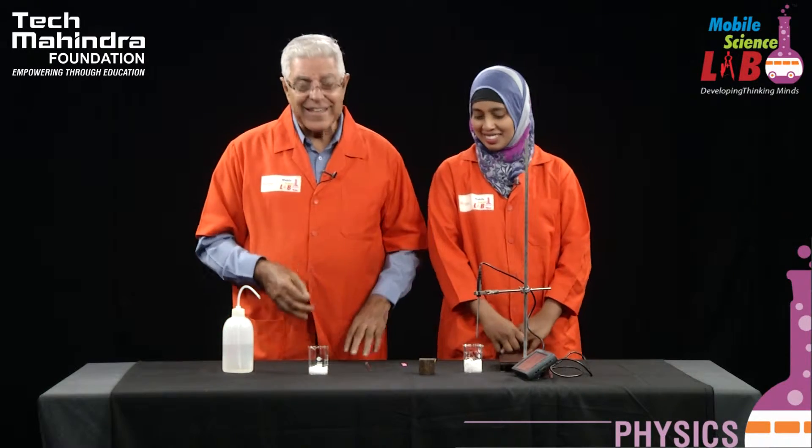Today we are going to do an experiment which is the very opposite of exothermic reaction. What would that be? Endothermic reaction. Exactly right. Endothermic is the opposite of exothermic. Endothermic means the reaction will turn cold — the materials or chemicals we are going to use will produce a coldness or coolness.